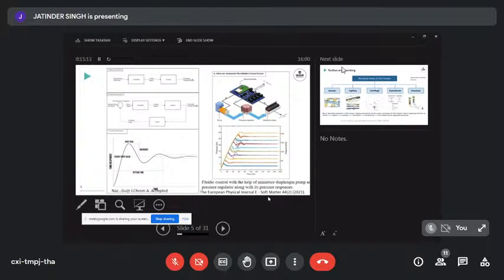So you get more accurate results that way, but you need a somewhat more complex system, including having a sensor there for your output.